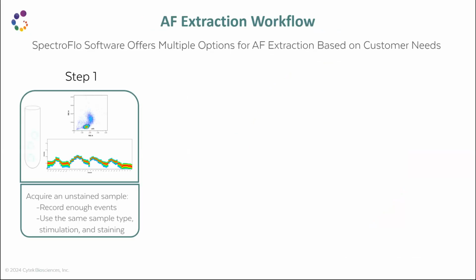So let's go through the step-by-step on what to do if you have autofluorescence. And first, how to identify if you need to extract it. And this is going to depend on customer needs. That's why we have multiple workflows and multiple modes for you to decide which one fits your data better.